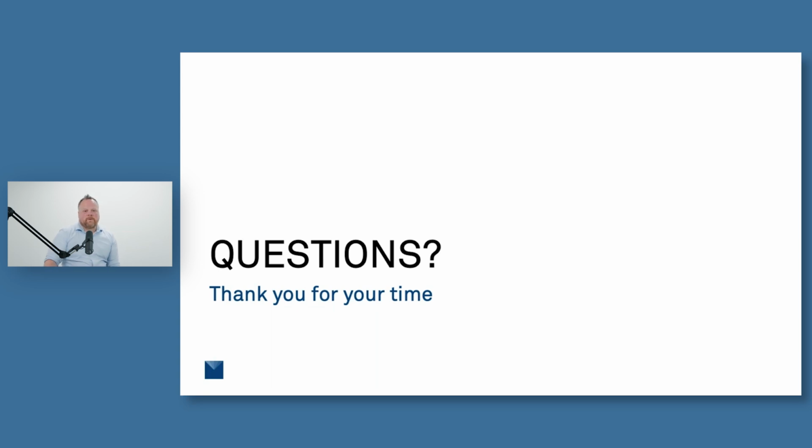Yeah, that's a great question. At the moment, there isn't really another instrument out there that does the full thermal dryout curves like we do. Most of the other methods that people are using are the ones we discussed earlier, where you take the sample, take the initial reading when it's saturated, dry it out a little bit in an oven, and then wait for it to come back to room temperature, take the other reading, and repeat that however many times you want.